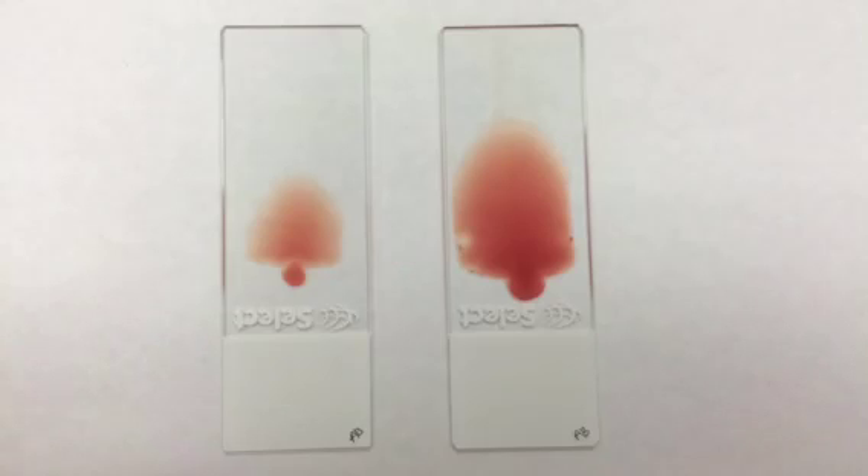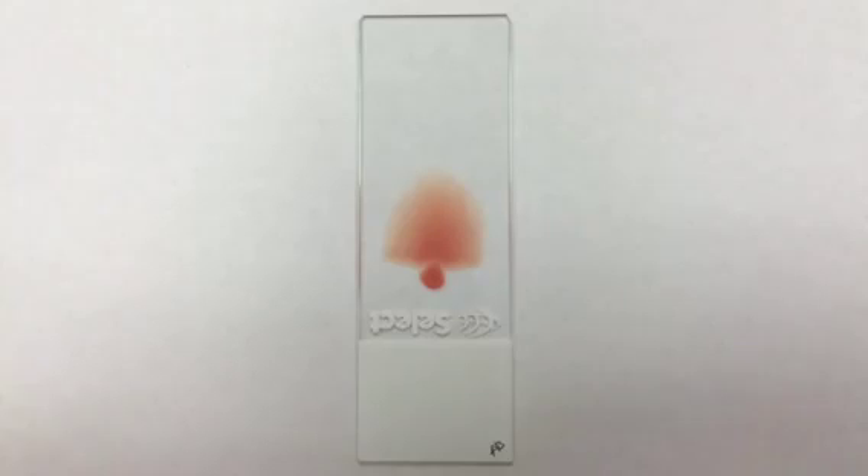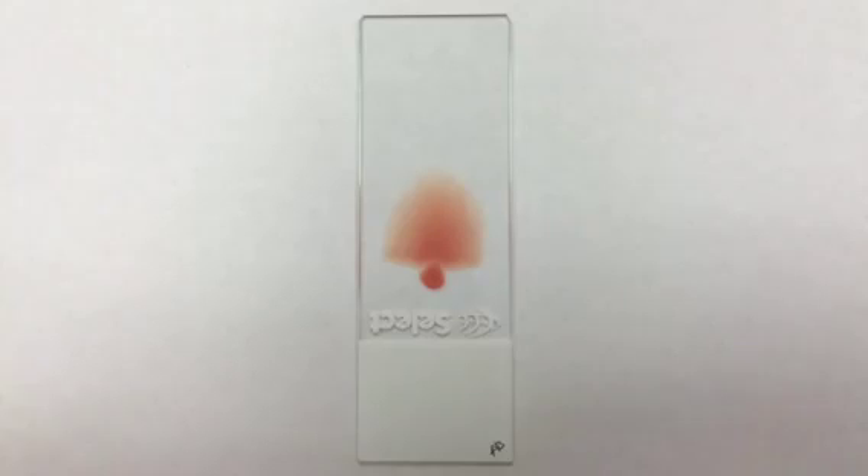The other A in A-S-A-P stands for amount of blood. This one had a teeny weensy amount of blood. That means this slide had too much blood — notice how dark it is.